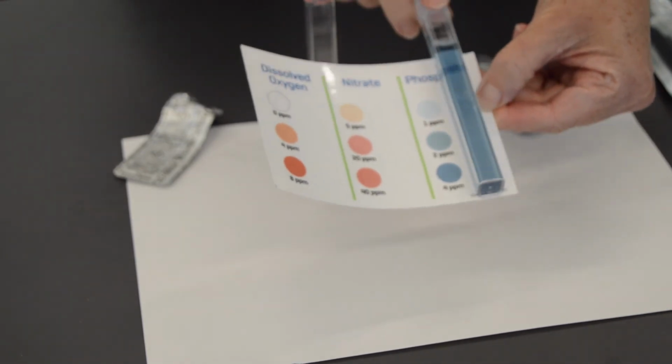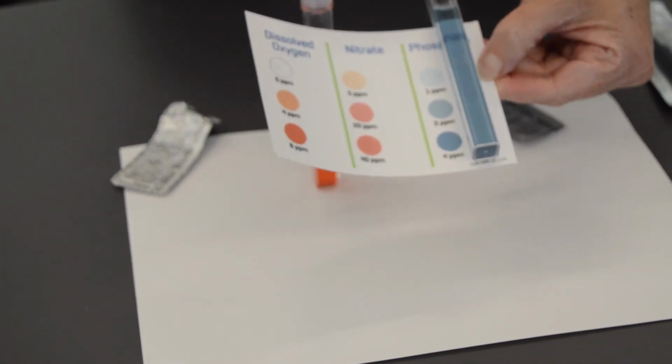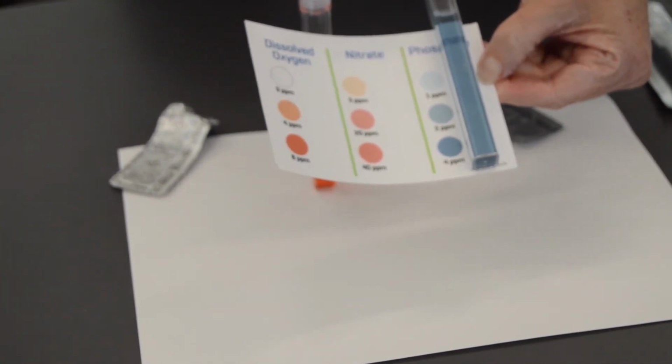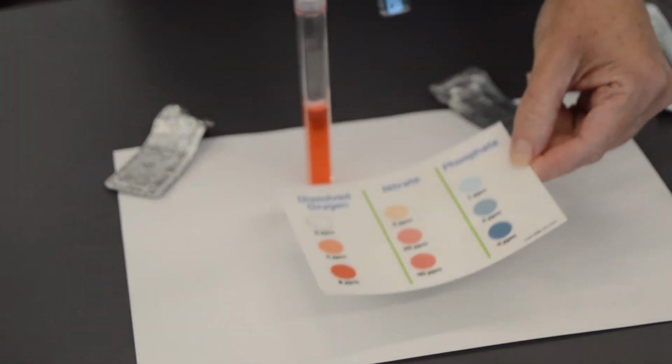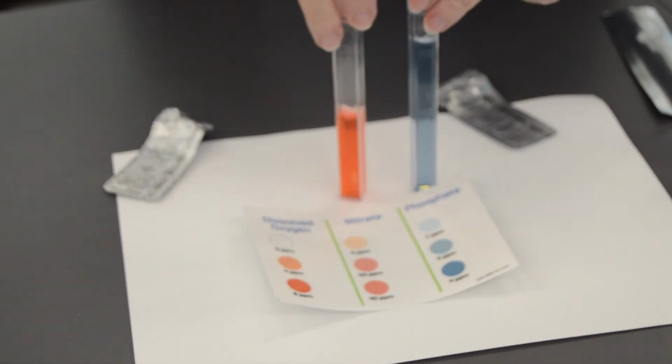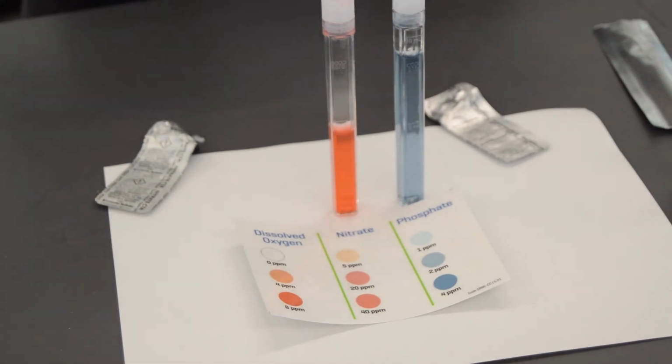And phosphate, we are up at 4 ppm or higher. Feel pretty confident with that, and again, that's up at the eutrophic level. You're up in the eutrophic region there. So if you get tests that look like this out of any natural water system, you're going to have some massive algal blooms in the summer and the spring.